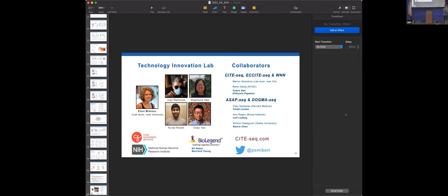Great, thank you. There's a few more questions in the chat, but I'll just ask the audience if there's any in-person questions to be asked right now. One of the follow-ups is from Chris Jackson: how difficult is it to control or normalize for cell size? It's a good question. It's not something we've ever really spent a lot of time worrying about. Most human cells that we work on fit nicely into a 10x Genomics droplet, so that's not typically an issue.